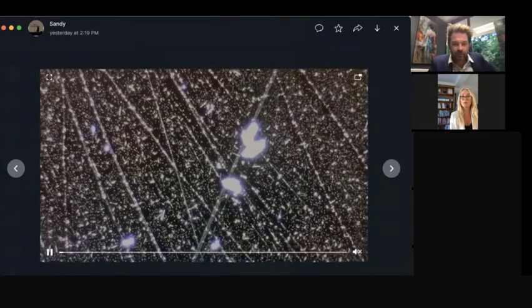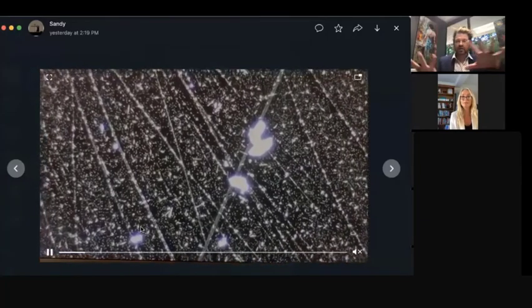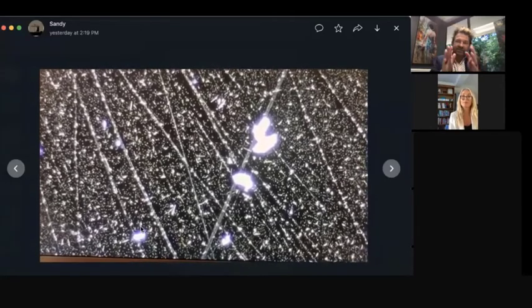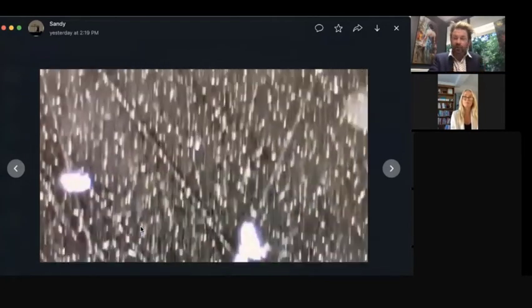That's so cool. It's just been so incredible to watch, to watch it change over time and see what it was doing. And energetic. Yeah, so you're actually seeing them shift in their position and their alignment in a really static environment, because that solution is sitting under a slide. You hadn't moved it, it hadn't shaken, you hadn't done anything to change it. It's structuring on its own. Yeah, totally on its own. It was quite magnificent to watch. I've never seen anything like it.